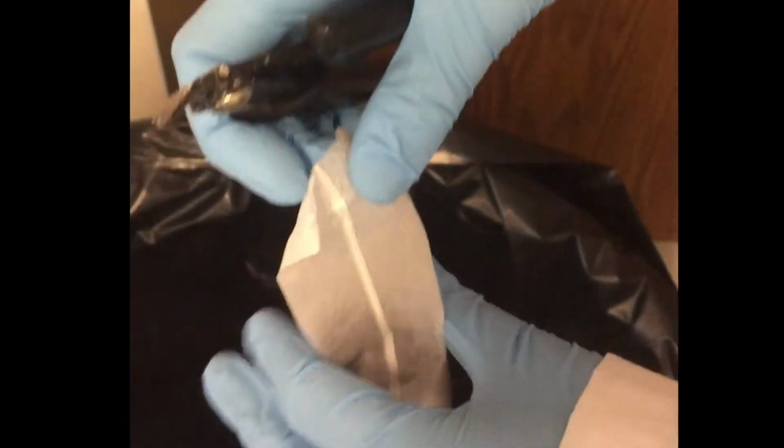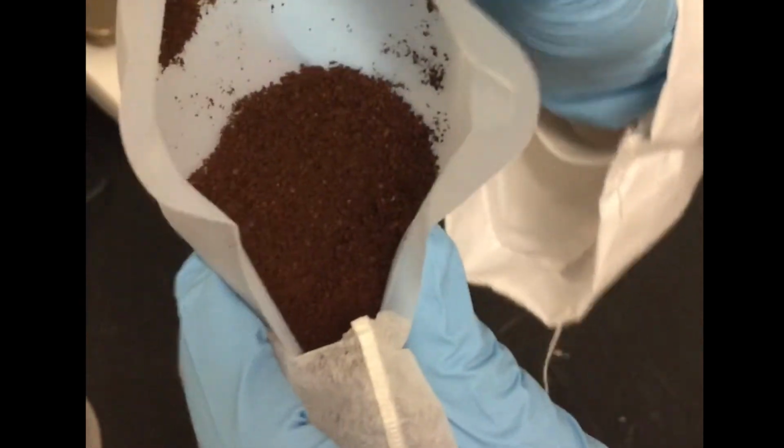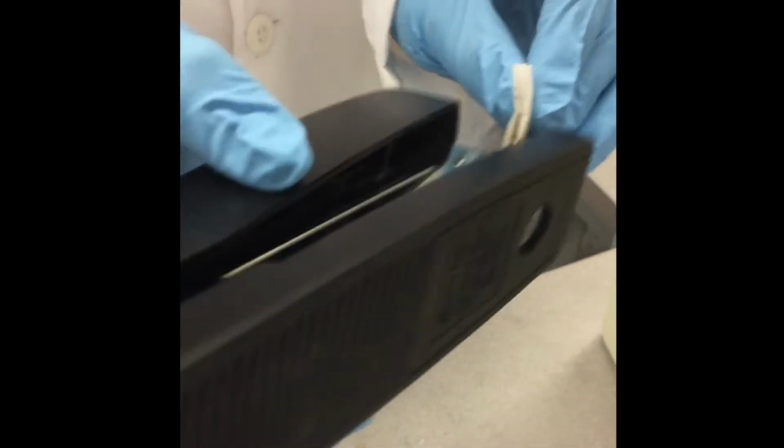To start, tea bags are opened and the tea is removed. Coffee grinds of the desired grind size are then massed out to 3 grams and placed inside the empty tea bag. The tea bag is sealed and is now ready to be used for the experiment.